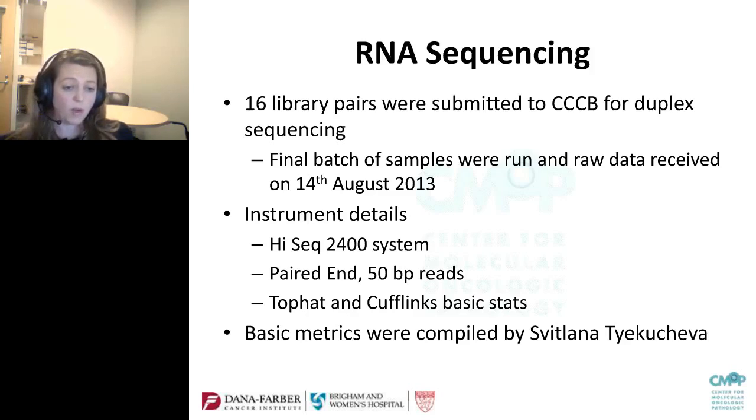In conjunction with what we got from the core, I also collaborate with a bioinformaticist, Svetlana Tekmucheva, who took the raw data, generated basic metrics, and aligned the reads separately, because a big component of the work we want to do is to establish new algorithms for looking at FFPE tissue sequencing data.